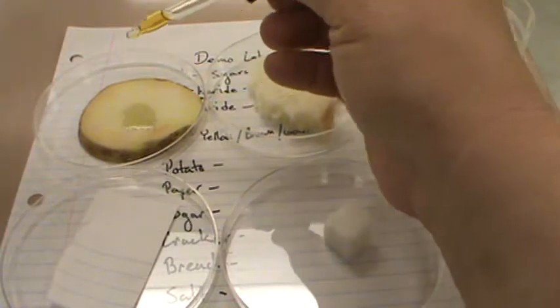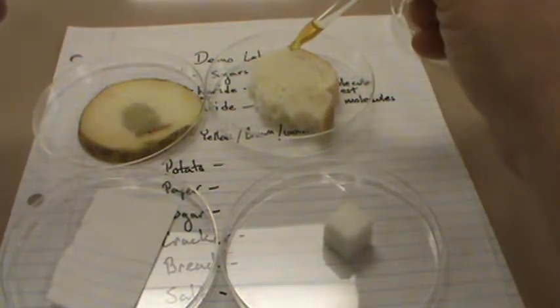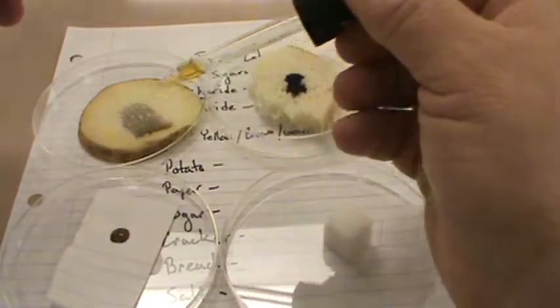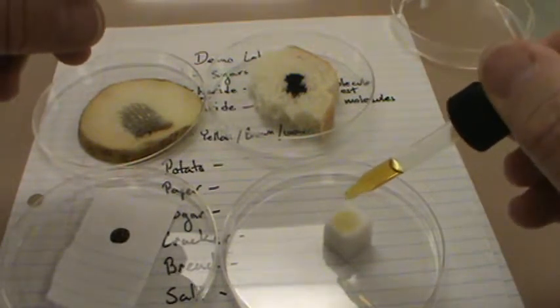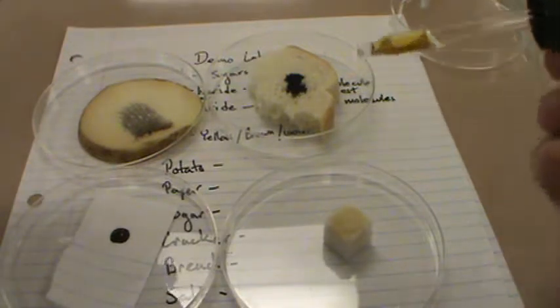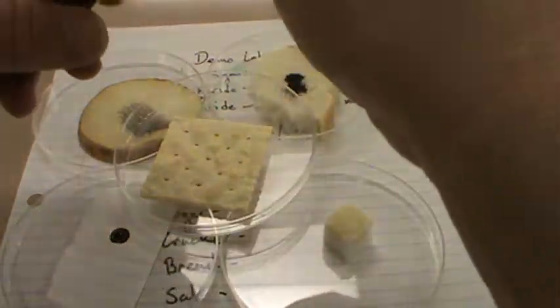Let me drop some in there, and yes, it seems to be doing some kind of a color change. Let's go into the bread. Oh my, that was a definite color change right there. I have the white paper. Oh my, that changed right away. What's happening here? And then I've got the sugar cube. Well, the sugar cube didn't change color. It's just going to stay that nice golden brown on the top. Let me get out the cracker.